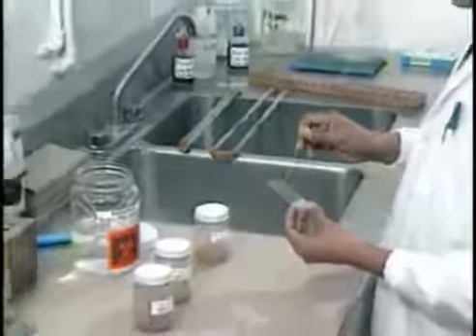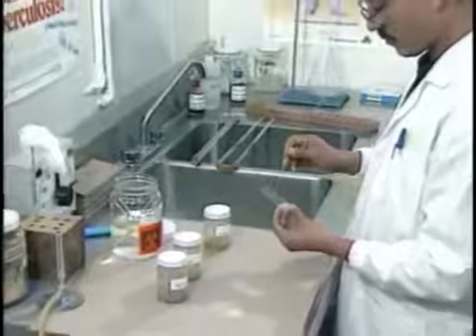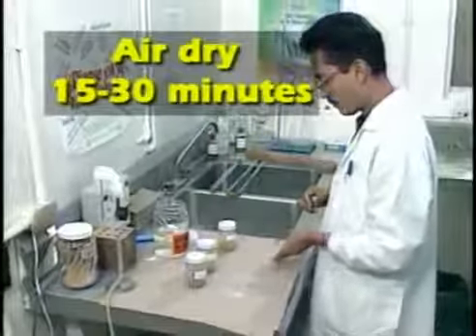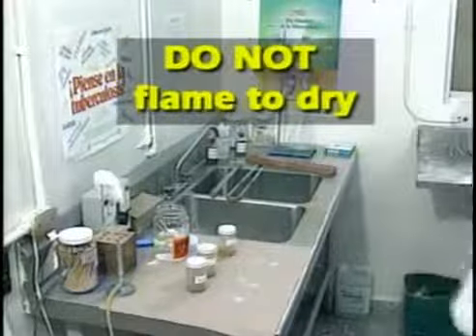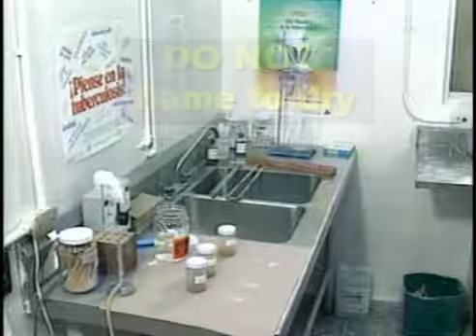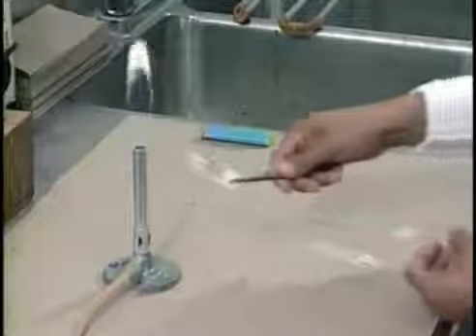Wet slides can create aerosols if disturbed. Place them in a protected area where they can air dry for 15 to 30 minutes. Do not flame them to induce drying. This can also produce aerosols.